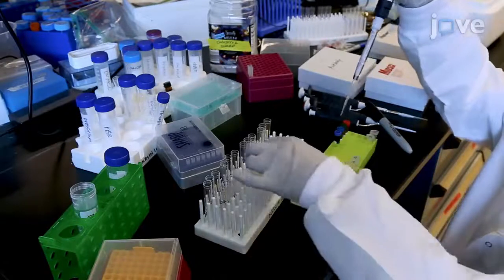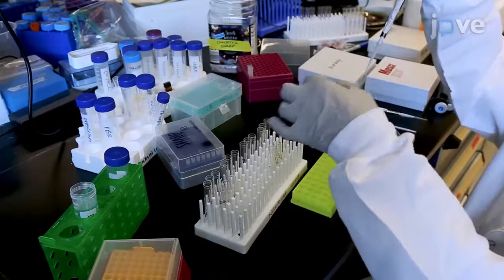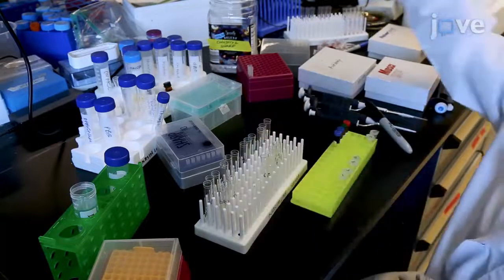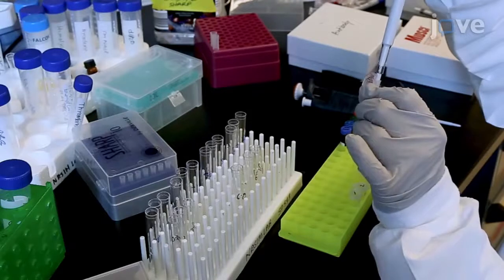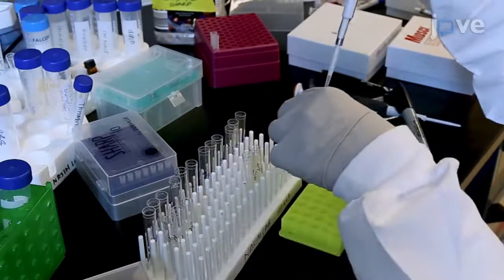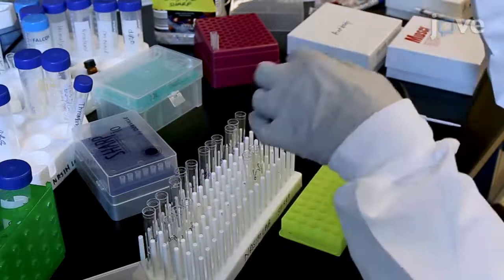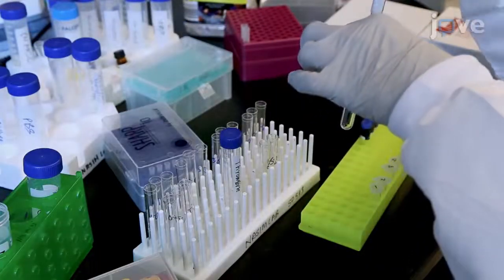For platelet activation, transfer 1 to 2 times 10 to the 6 platelets to a new tube containing 100 microliters of staining buffer. Add 1 to 2 times 10 to the 6 platelets to a different tube containing 100 microliters of staining buffer supplemented with 0.4 mM GPRP peptide. Add thrombin to the tube with the GPRP peptide to activate the platelets.